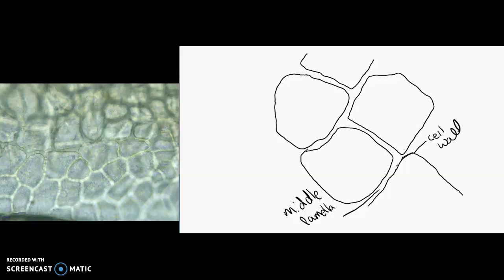And then sometimes inside here you can see a little bit of that large central vacuole. It's kind of clear, so sometimes you can see it, sometimes you can't.